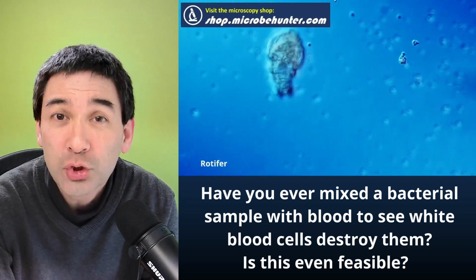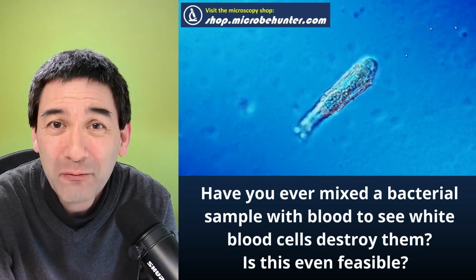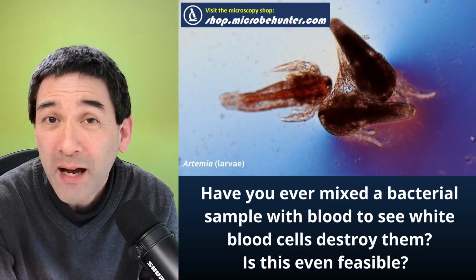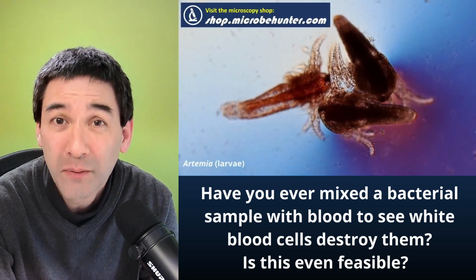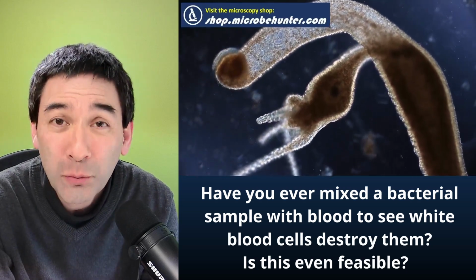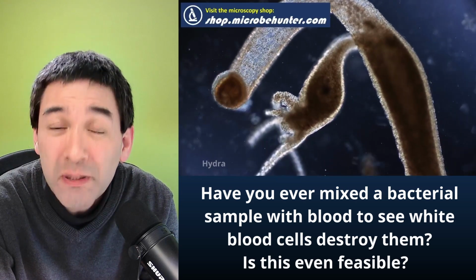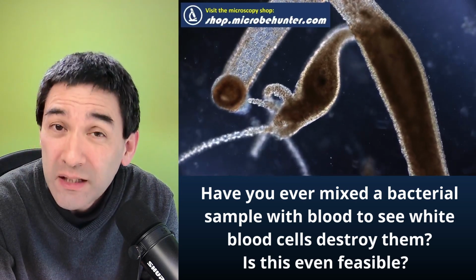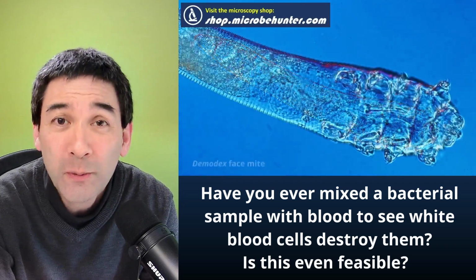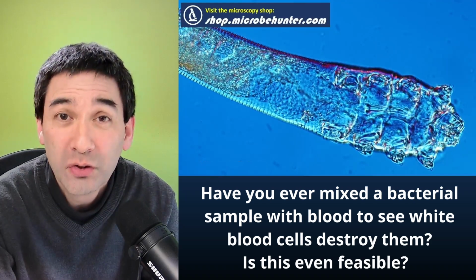I have not yet tried doing that, but I will take this question here as a good incentive or opportunity to actually try it out myself. And maybe this is also going to be a video in the future. Now, I think there are things that you have to take care of, and they are the following. First of all, of course, you need a source of bacteria. I do not recommend that you grow your own bacteria, for safety reasons, but also because the concentration would be too high. So what you need is only a couple of individual cells that you then can focus on under the microscope, and then you can observe whether white blood cells will actually approach it and engulf it to eat it up.